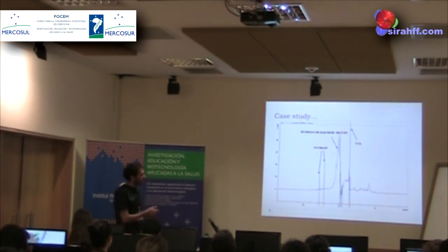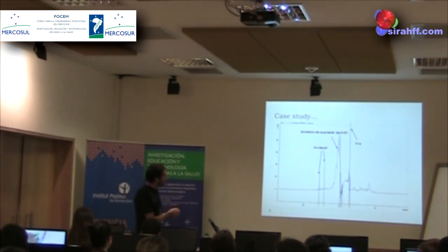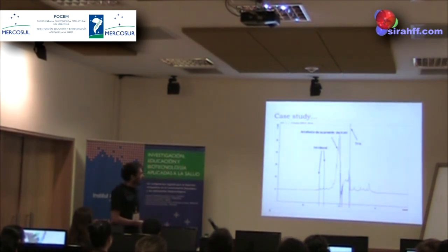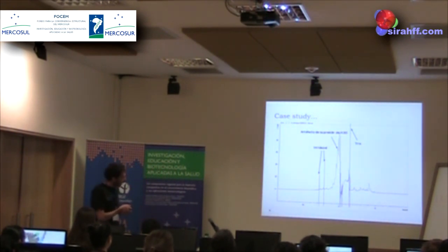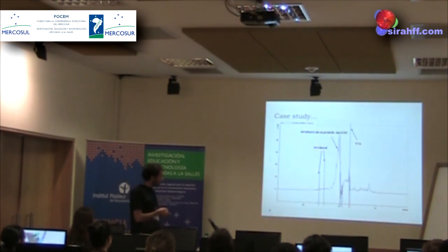Yes, okay, great. So they come with their sample and you can immediately see that they forgot to get rid of this. This signal is scaled in a way that it goes over the roof. And well, this region here is dirty. That also affects the water suppression. That's the middle zone here. But below all of these artifacts, we have protein.